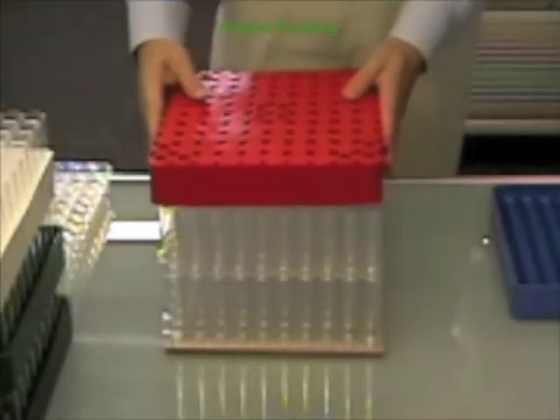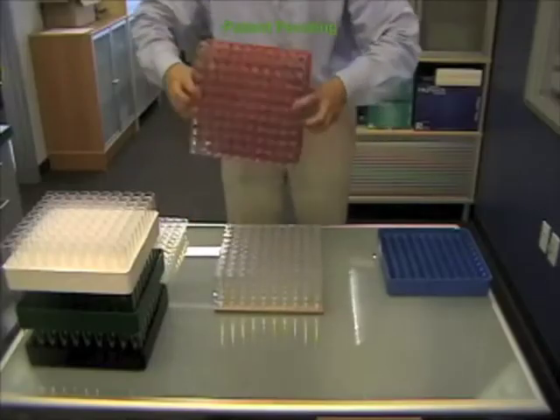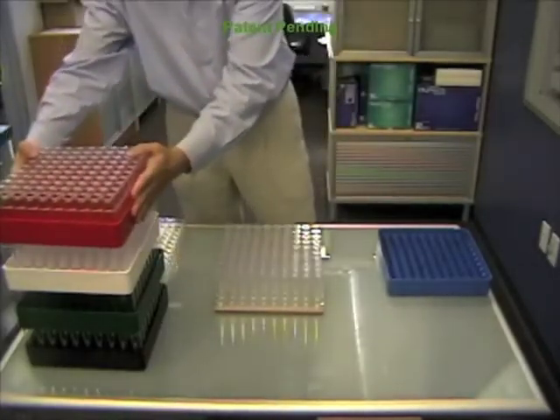Some manual dexterity is required. Manipulation of the tray over vials is often necessary. Loading of vials is not always seamless, but you get better with practice.